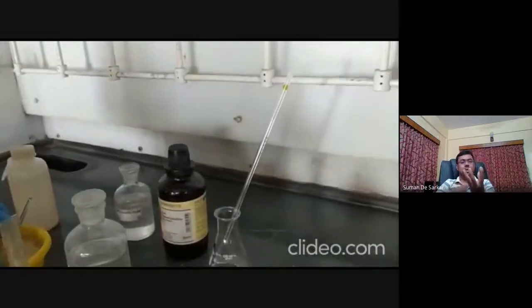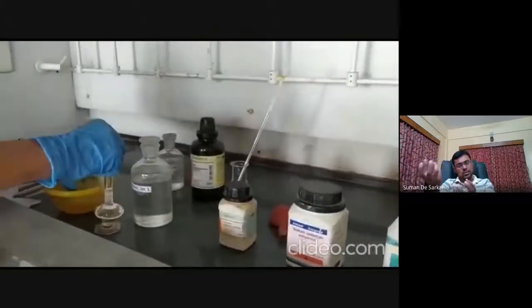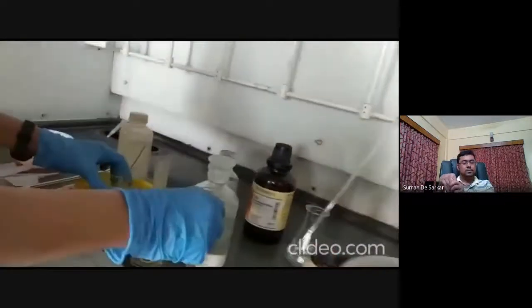We don't want to take any chance in the cold solution of diazotized salt. If we add something hot, then it may also decompose some diazonium salt. That's why the acetic acid solution of dimethyl aniline is also being cooled. So both the cooled solutions will mix.